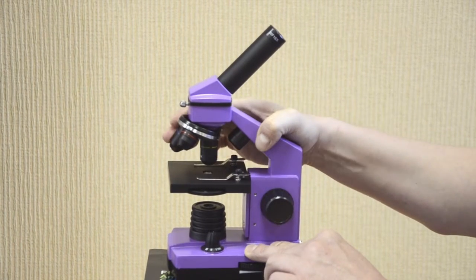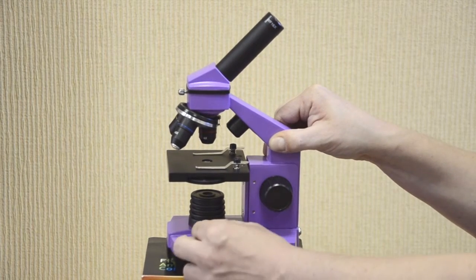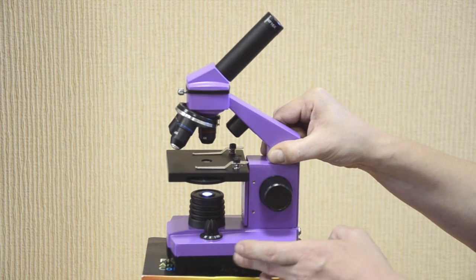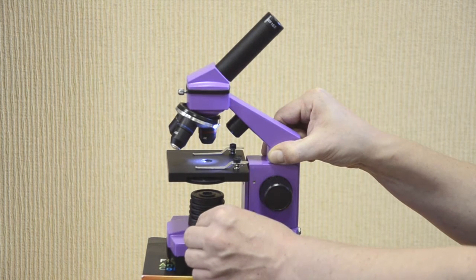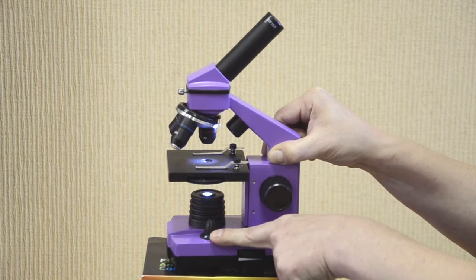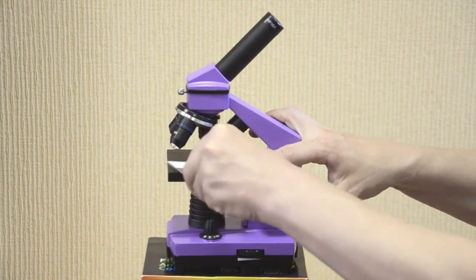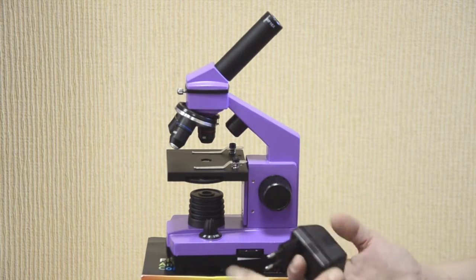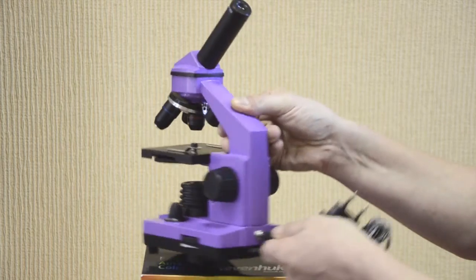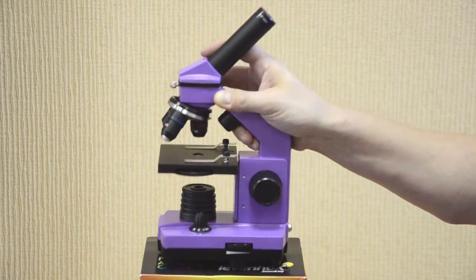The revolving nosepiece holds 3 objectives. Focus adjustment, lower illumination with adjustable brightness, upper illumination, and combined illumination — both upper and lower lights — can all be turned on. Here's the diaphragm disc and slide holders. You can plug the device into an outlet using a 110-volt or 220-volt adapter included in the kit, or just insert 3 batteries. The eyepiece is removable with 16X magnification power.